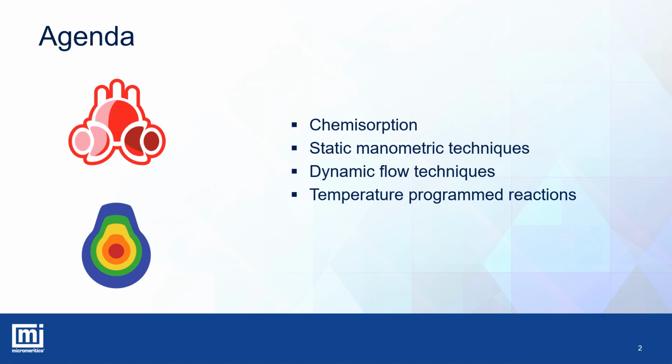Welcome everybody to this second webinar about heterogeneous catalyst. Today we will have some deeper description of the available techniques for chemical gas adsorption in isothermal conditions and the dynamic methods used in temperature program reactions.